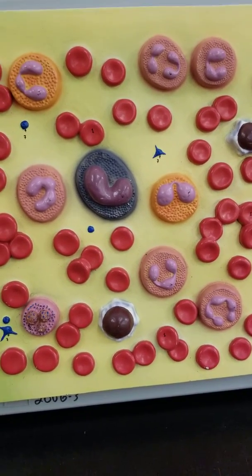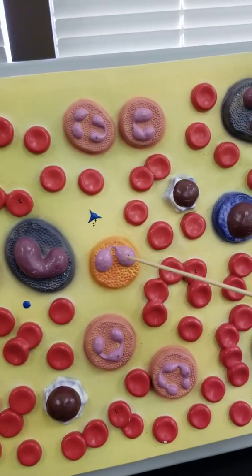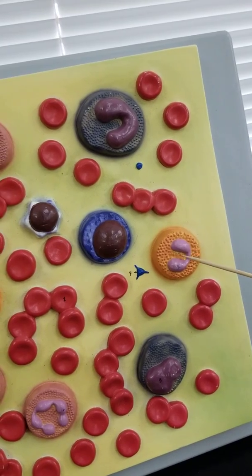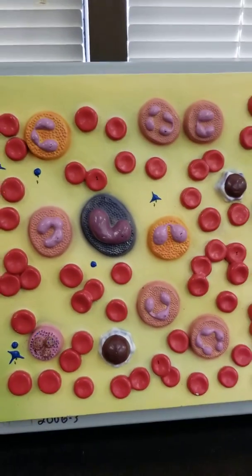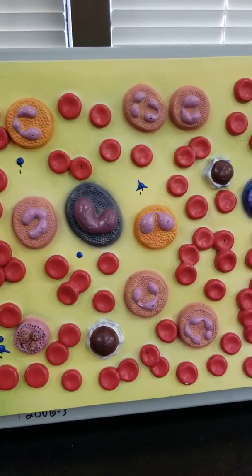Next, we're going to look for red staining granules, and there are 3 cells on this model here, here, and here that represent the red staining. And if you remember from lecture, those are called eosinophils, and they stain that way based on acid stain.